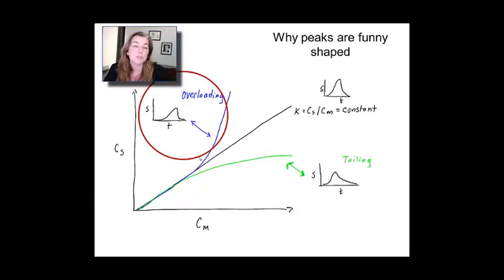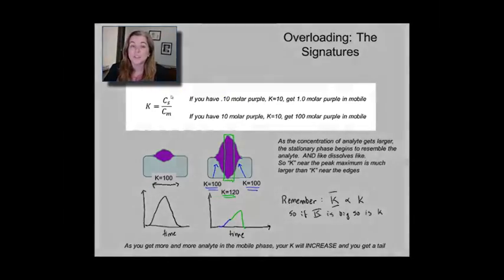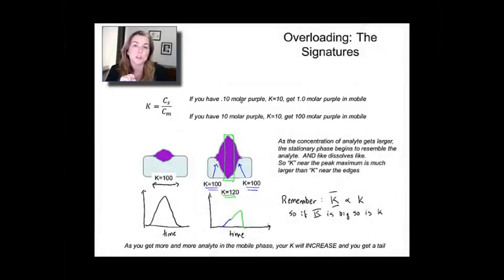So, let's talk a little bit about the overload issue. So, in overloading, what's happening is k is not actually staying constant. So, we would expect, if you went from 0.10 molar to 10 molar, that you would still have this relationship holding.